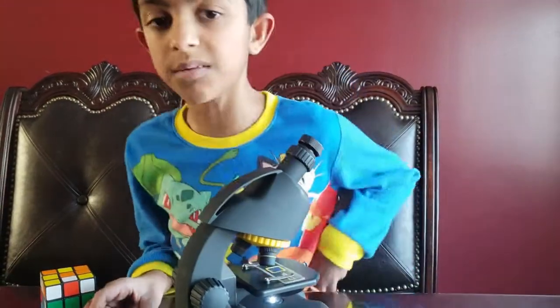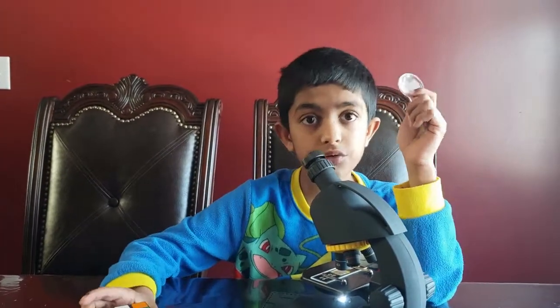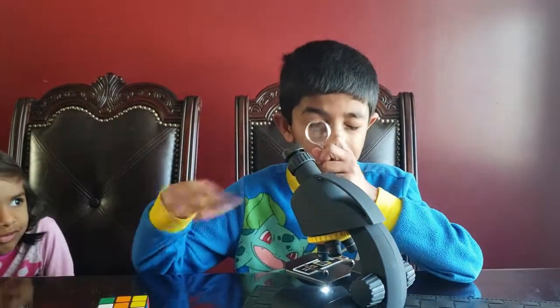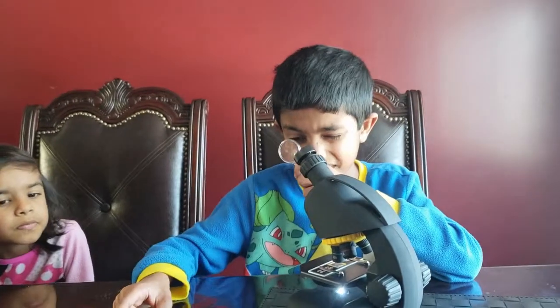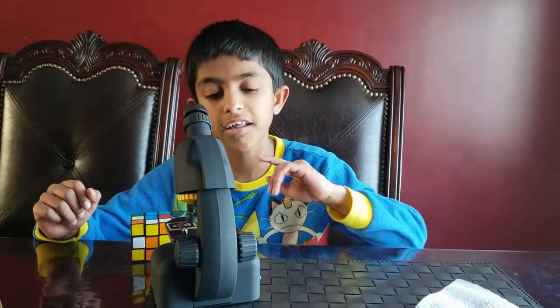Then it comes to your eye where you see it. This is a magnifying glass, and this is a Rubik's cube. If you look at the Rubik's cube through the magnifying glass, the Rubik's cube is opaque — that means light bounces off it to the magnifying glass. You can see transparent things through a microscope. But how do you make it transparent? There are two ways: one is to cut it into thin slices; the other is to penetrate it with some material that will make it transparent.